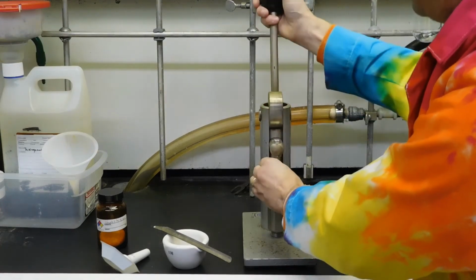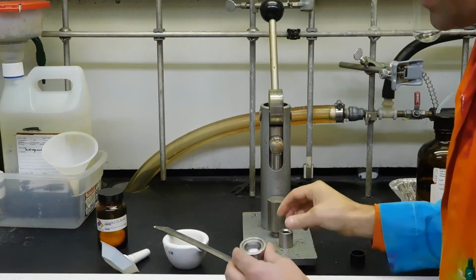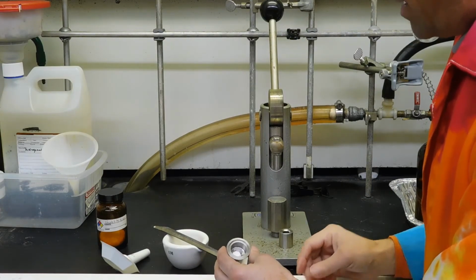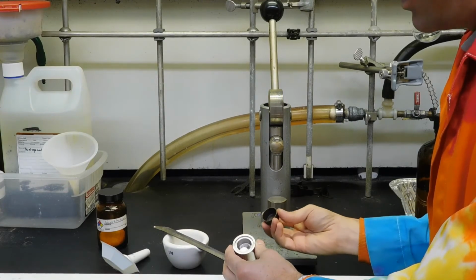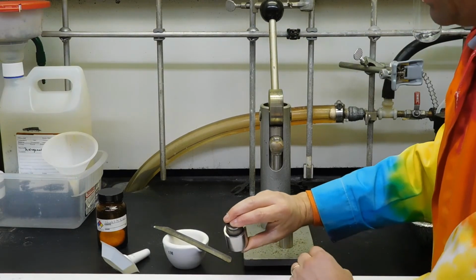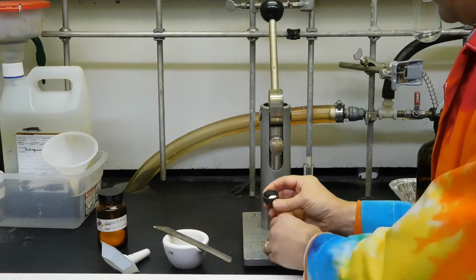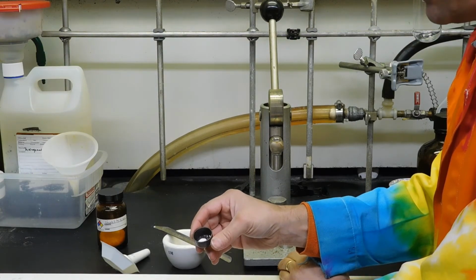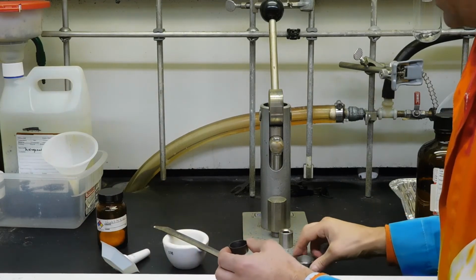And if you made a good pellet, and you take this off, you'll have a pretty solid pellet in here. This one's falling apart a little bit. It might be worth doing it again, but in the interest of the time in this video, I'm not going to do it twice. So then you just take the cup over it, turn it over like this, and now you've got your pellet sitting in here, and we'll talk about how to put it in the calorimeter in another video. But first you take it and weigh it on the analytical balance.